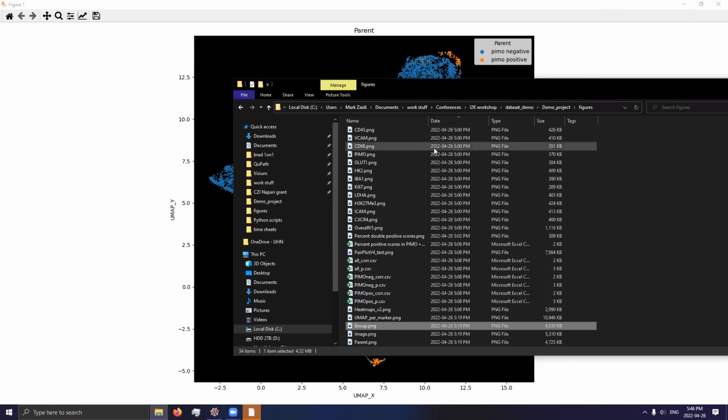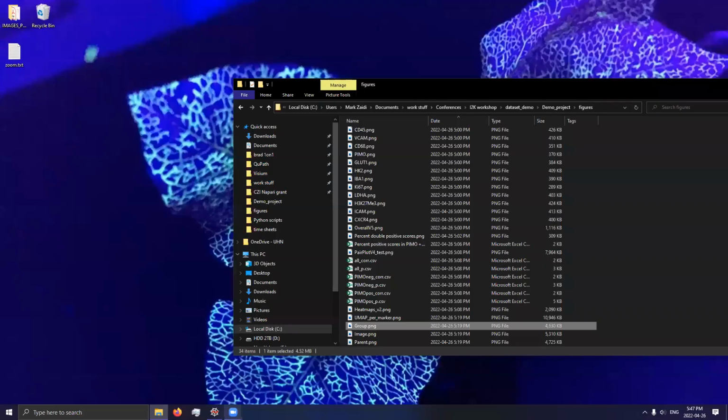Now, after we've computed the reduced dimensionality space, there's nothing to really stop us from performing clustering. The only reason I haven't done clustering yet is because, given that we have this semi-manual method of cell type assignment, there isn't really any new information gained from clustering unless we want to do an unsupervised method of comparing differences across our various samples.